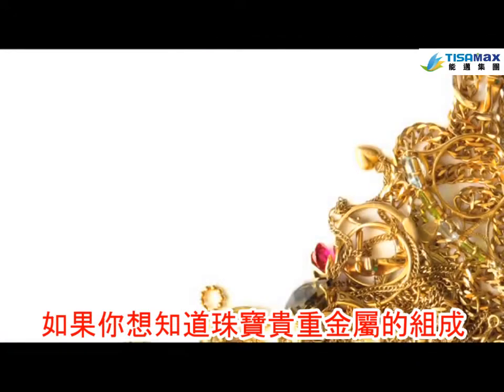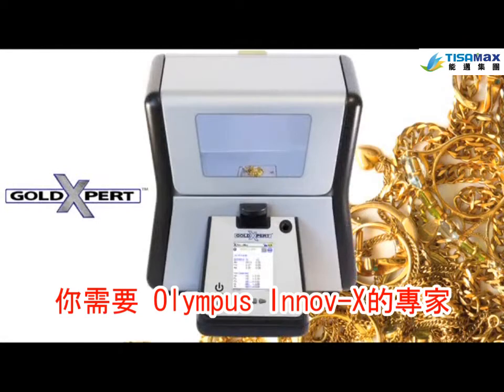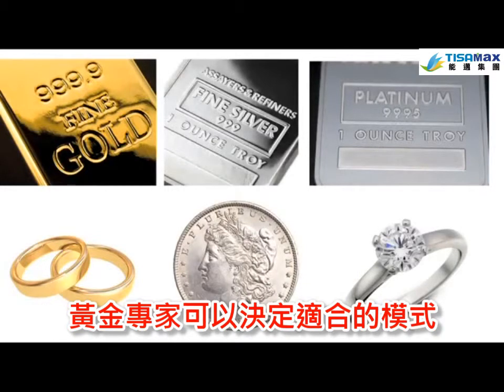If you need to know the composition of jewelry and precious metals, you need the Gold Expert from Olympus Inovex. Gold, silver, platinum, and their alloys — the Gold Expert can measure them all.